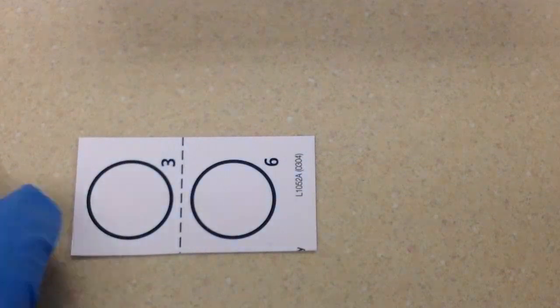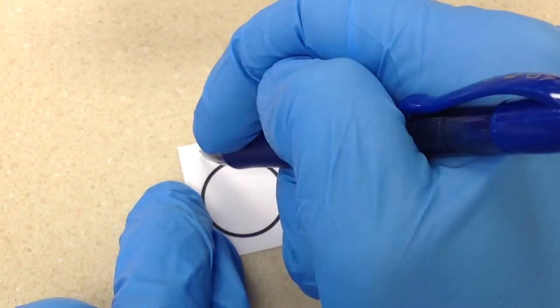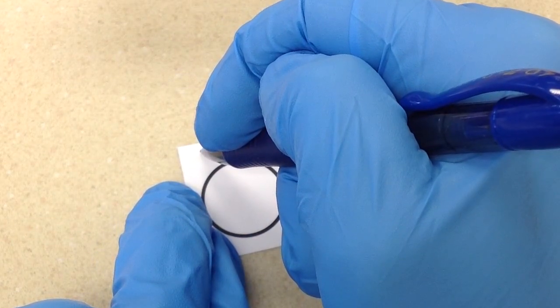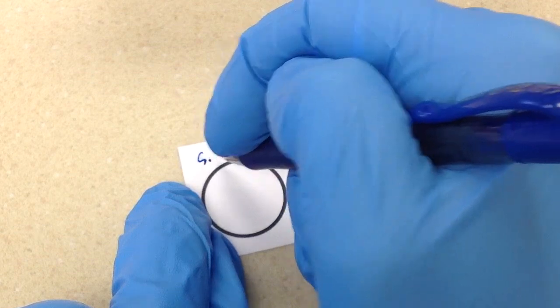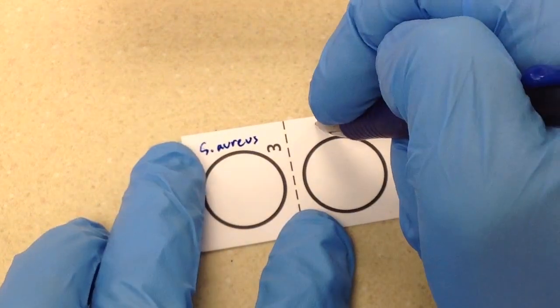The first thing we'll do is go ahead and label our card. I'm going to put 'Staph aureus' on the left and 'Control' on the right.